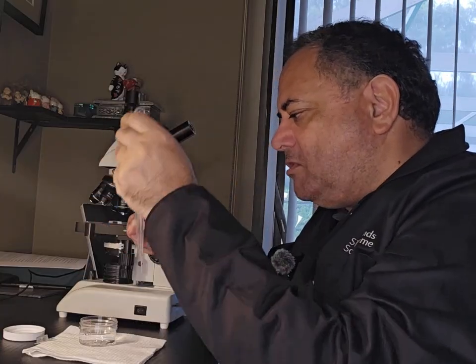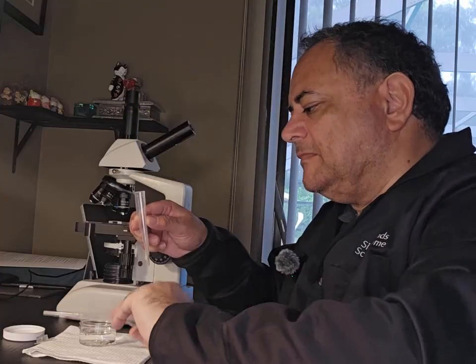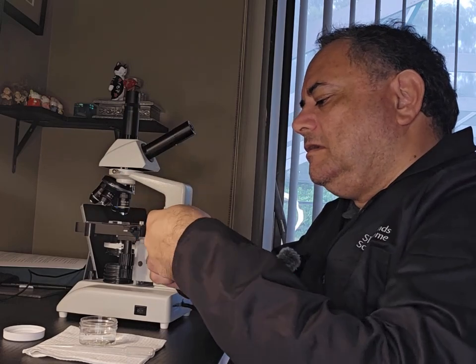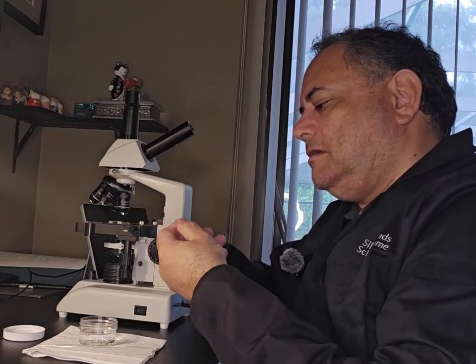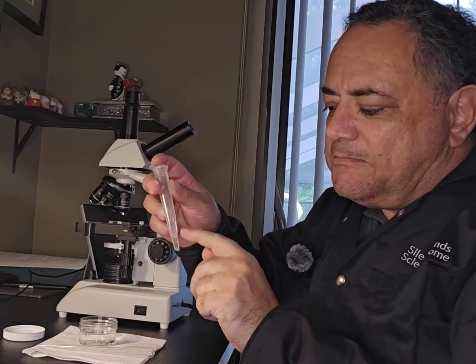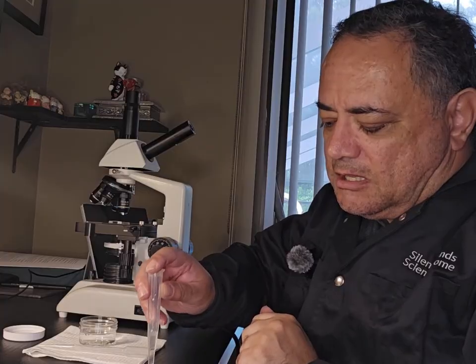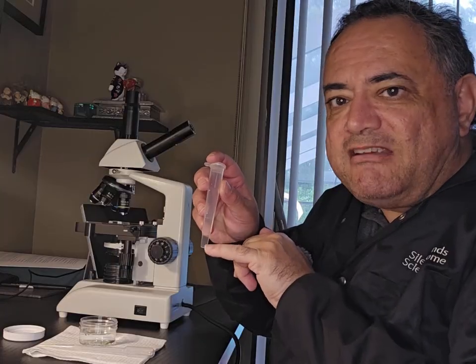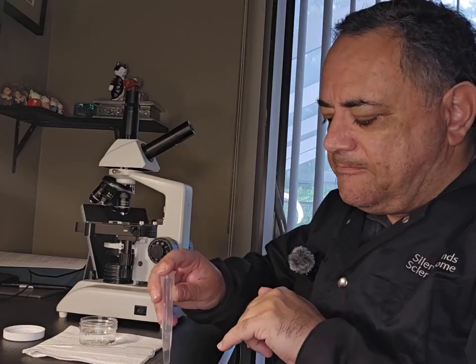I'll put a little bit more liquid, and then I cap it. And then I just tap to make sure that the bottom, the viewing area, has liquid in it.